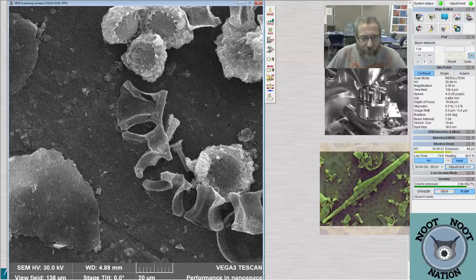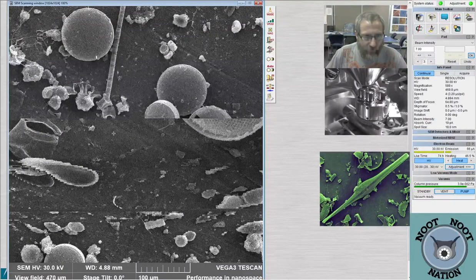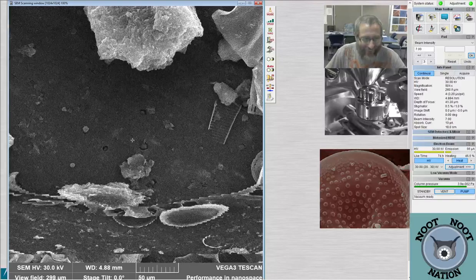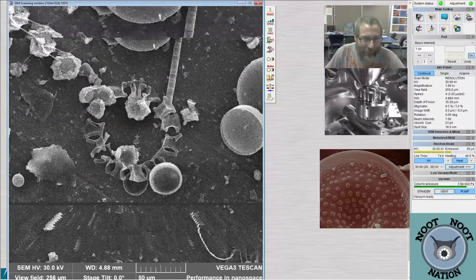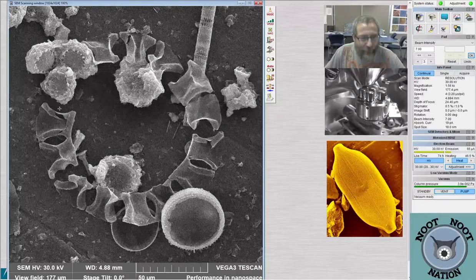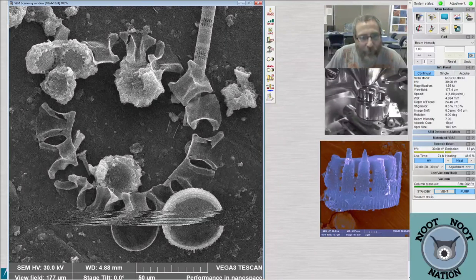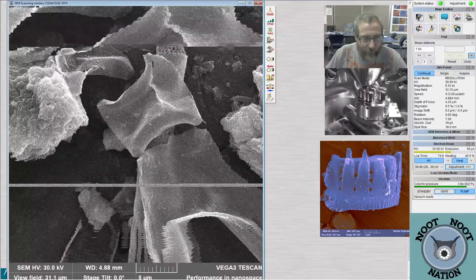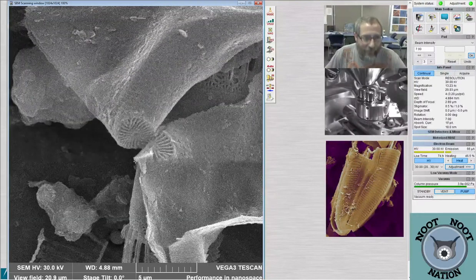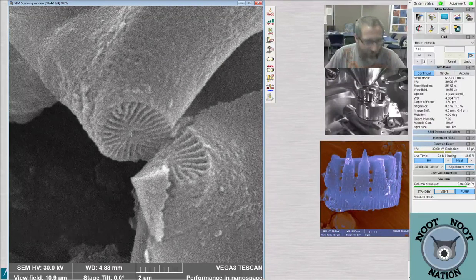They're so lightly silicified. I keep trying to tell it I want it to be in the middle of the screen, and then when I zoom in, it goes somewhere else. Oh, I think maybe it's okay here. I just zoomed in a little too far. So this ring around the outside is Eucampia. Here's another little cluster of these Thalassiosira clumps. And we saw some Eucampia before, and I got some nice pictures of them. They have these apical slot fields as opposed to pore fields, right? Look at that, like little stars where they hold on.